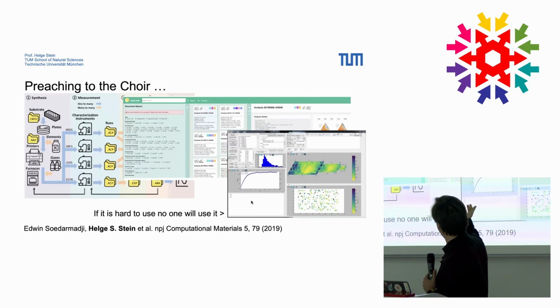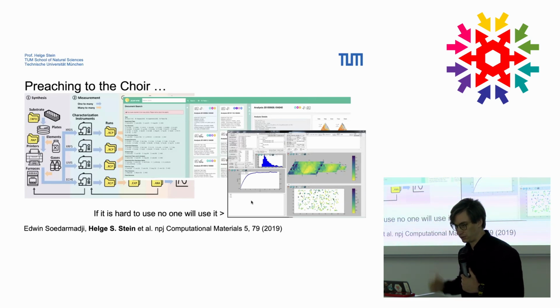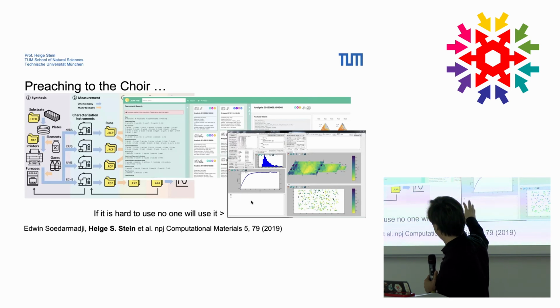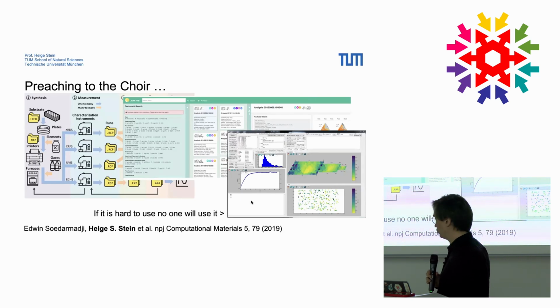So in the sense of you could load in a plate map, you could do some simple visualizations quite fast without much overhead. So again, I think having nice tracking of what you're doing in the lab, how your data is coming about, is all nice, but you really need a usable user interface. And to be honest, my group right now doesn't have that. Right now, you need to know how to code.